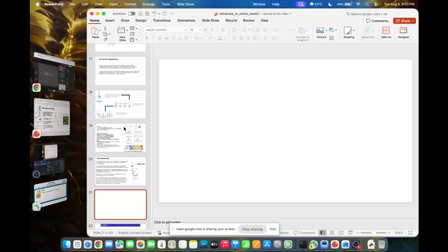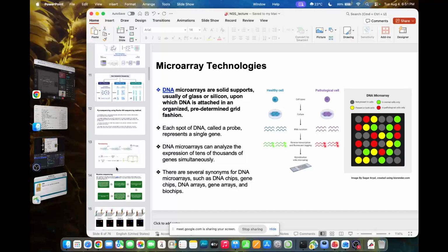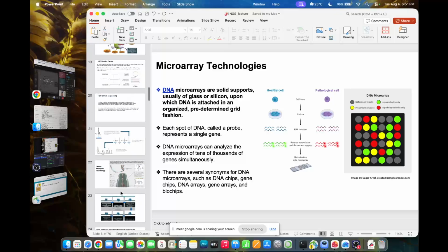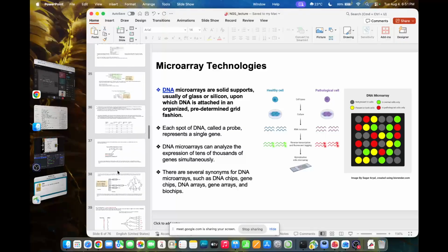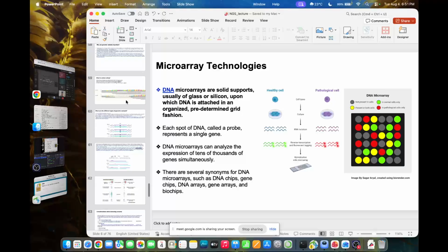Now, what I'm going to do is before I go into the assignment questions, I'm just going to quickly give you an overview, maybe 20 minutes or so, of maybe a slightly bit more of how we analyze the data that is generated through these sequencing techniques, right? Okay, this is an older slide I'm using. Sorry for that. We're going to talk about HiFi PacBio reads and Oxford Nanopore in later classes. I'm just going to talk about what happens after you generate the data, right? So I'm just going to start from here.